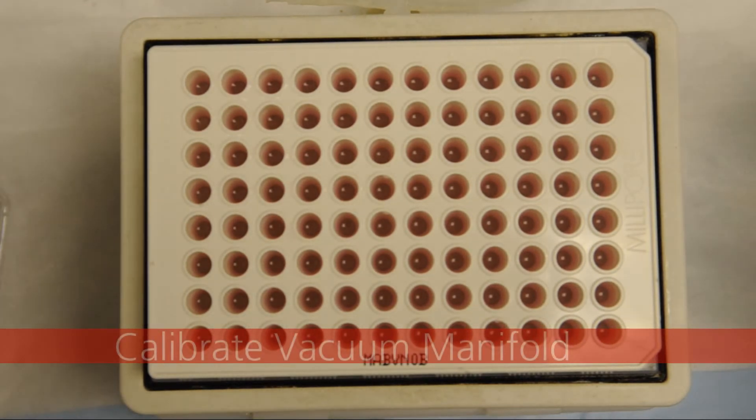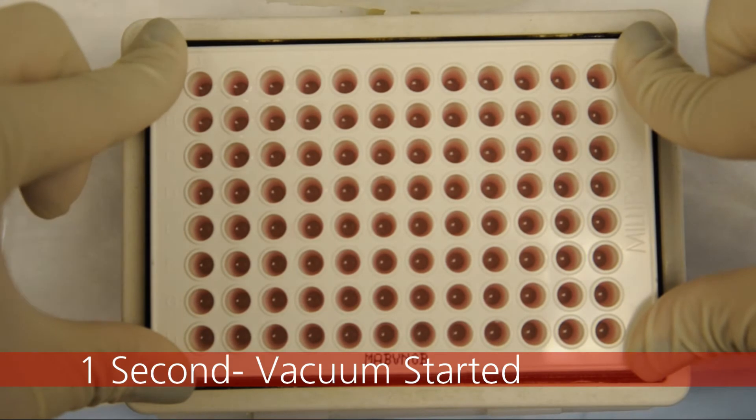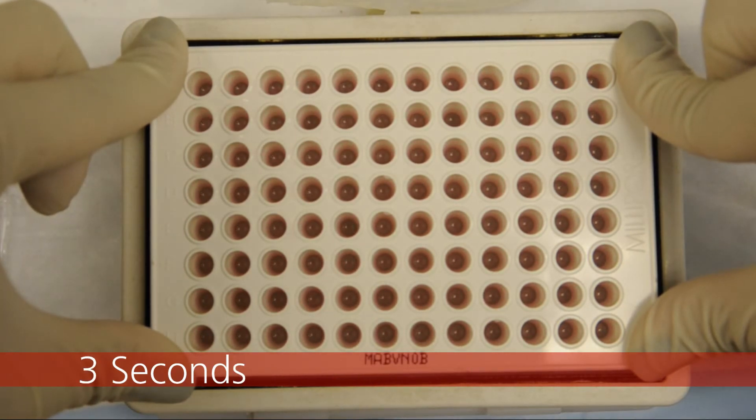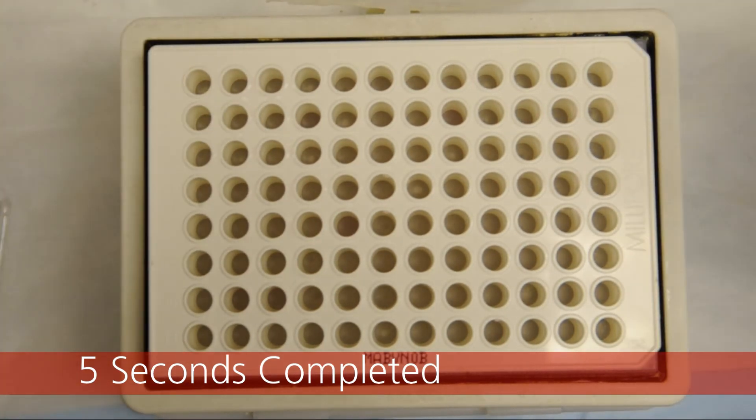Prior to washing, ensure that the vacuum manifold is calibrated. Using an old filter plate, adjust the vacuum so that the amount of time needed to evacuate the wells takes 4 to 6 seconds.